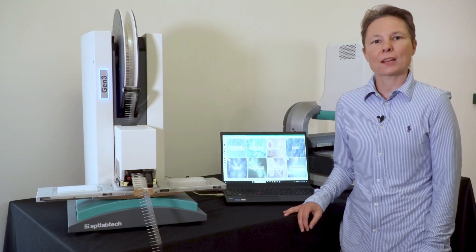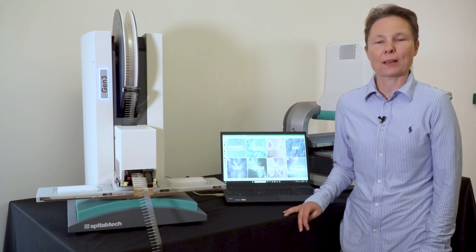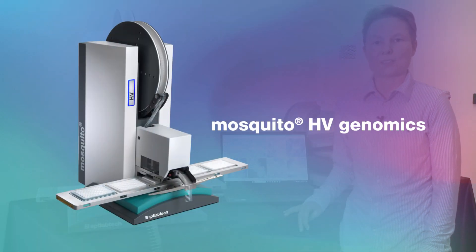For laboratories requiring higher throughput and greater walkaway capacity, Mosquito HV Genomics offers the same speed, accuracy, and volume range with two additional deck positions.